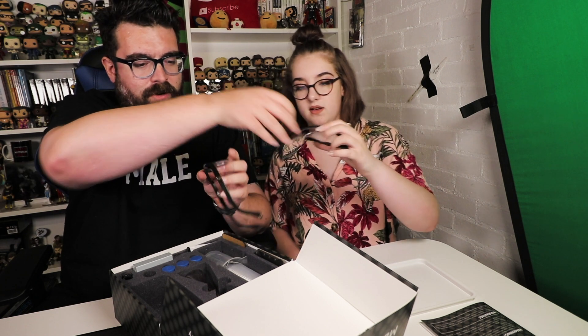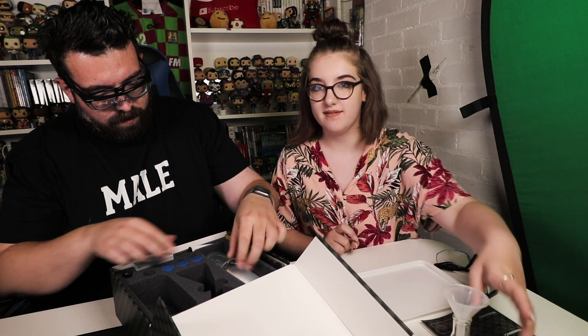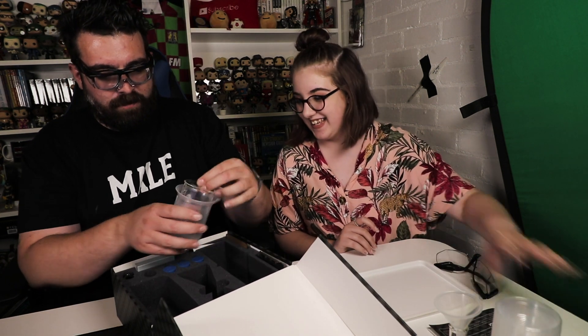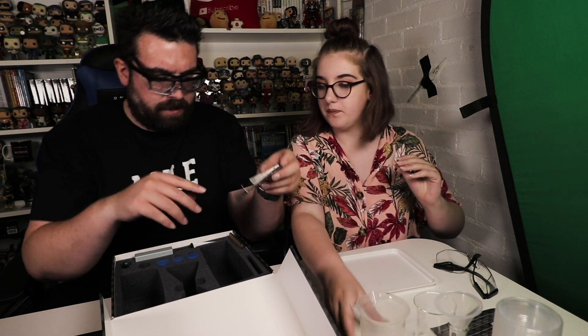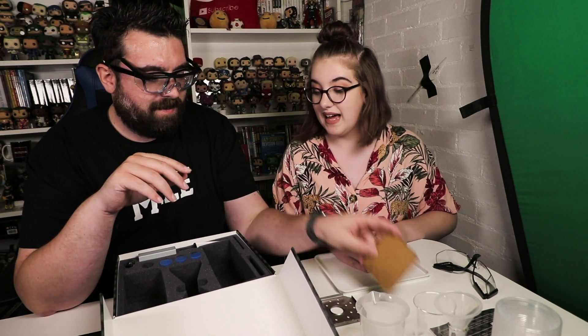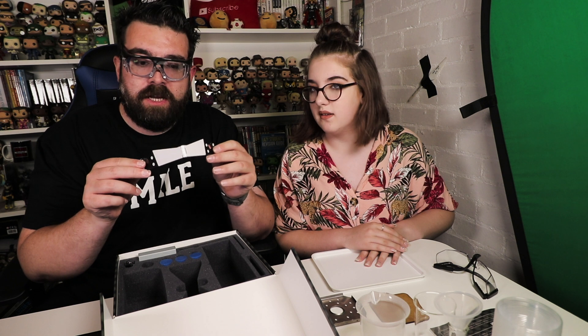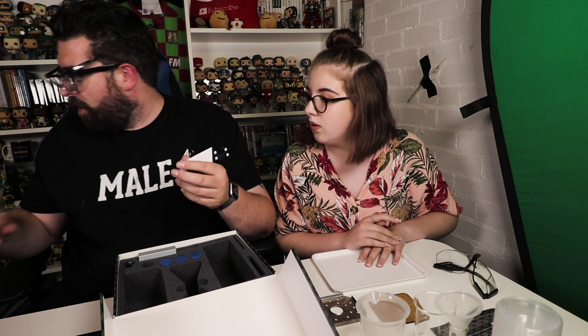Are they the same size? Wait, are these going to fit over my glasses? Because these are really small. Well, they're over my glasses. We have a proper science beaker, and a little stirrer to go in there. This is super cool. I always wanted a chemistry set when I was younger and I never got one. And we have more beakers, another little glass one and a plastic one. I feel like a scientist. I think this is the burner thing. And there's a little stand to put your phone on to follow the instructions. So cool. And then some stoppers and a clip.